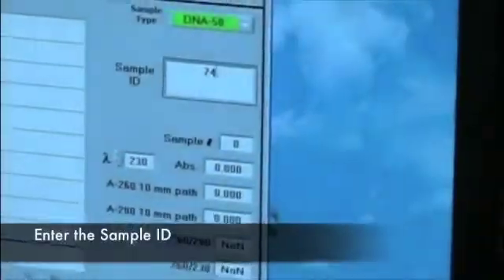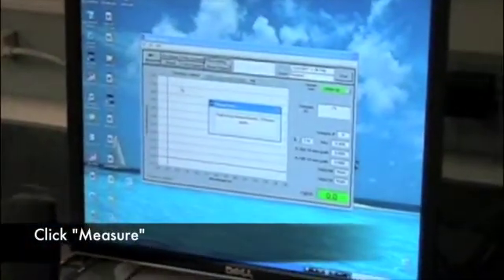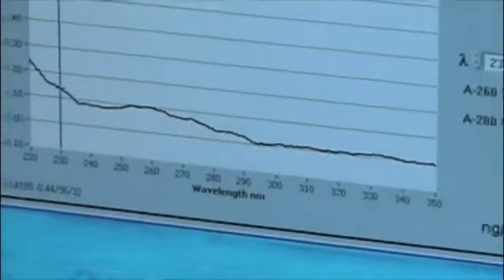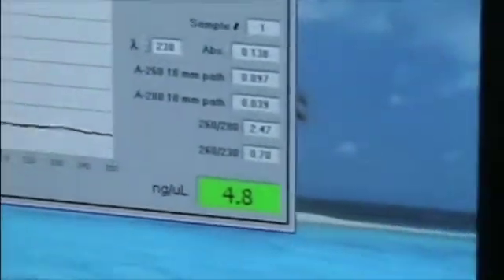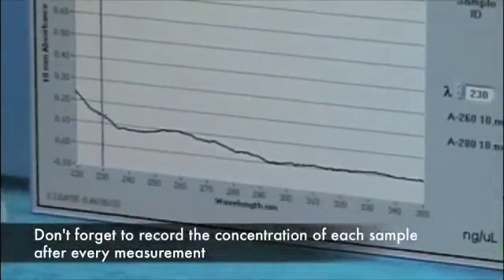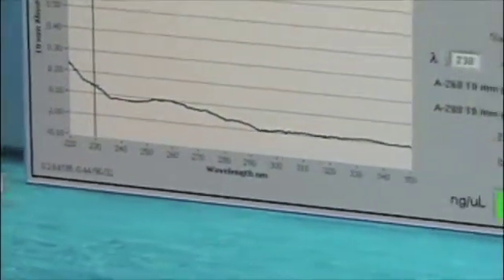Sample ID 74 is entered in. Now it clicks on measure and makes a measurement. Here's the profile — not a great profile by any means, but there's a little bump there, it's not straight flat. 4.8 nanograms per microliter. And how many microliters do we have? 50. We have 50 microliters — 4.8 times 50, so that's 200 nanograms total.